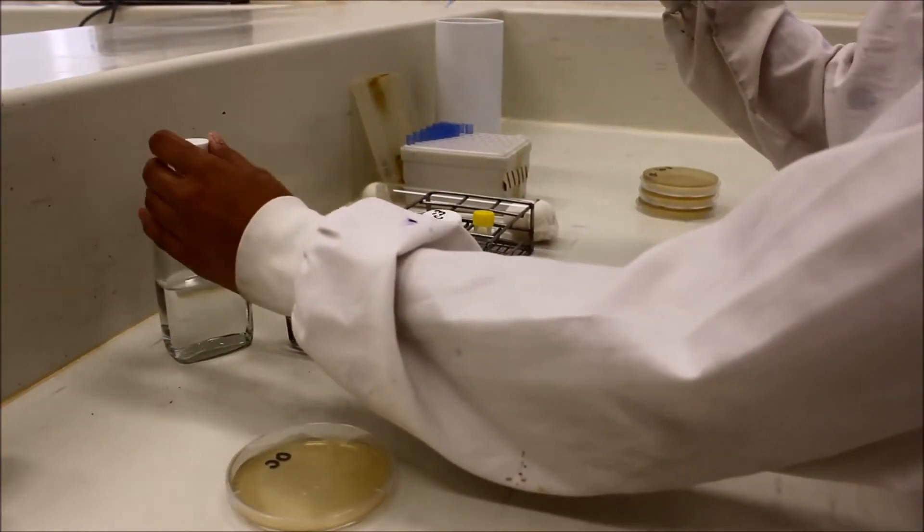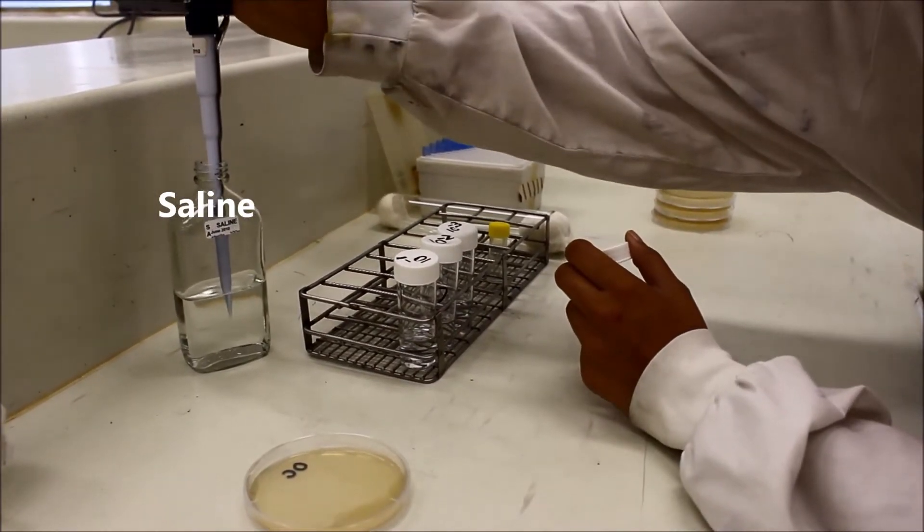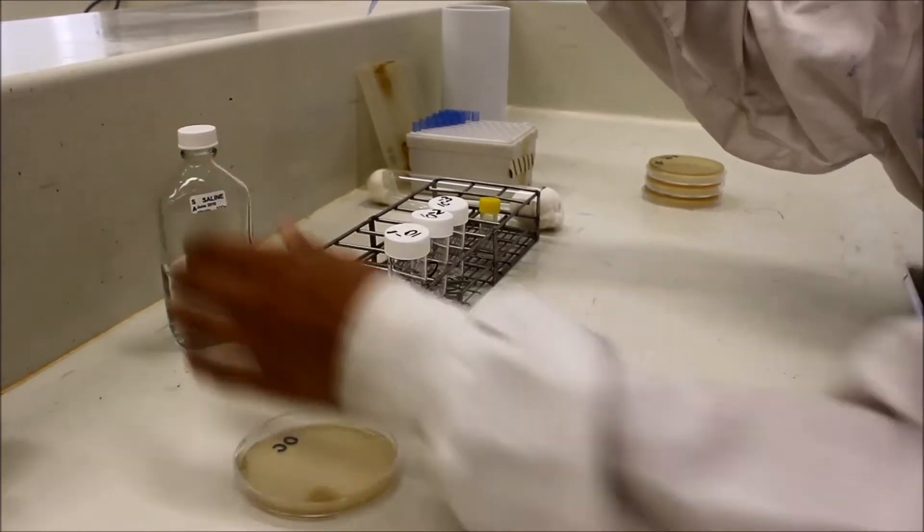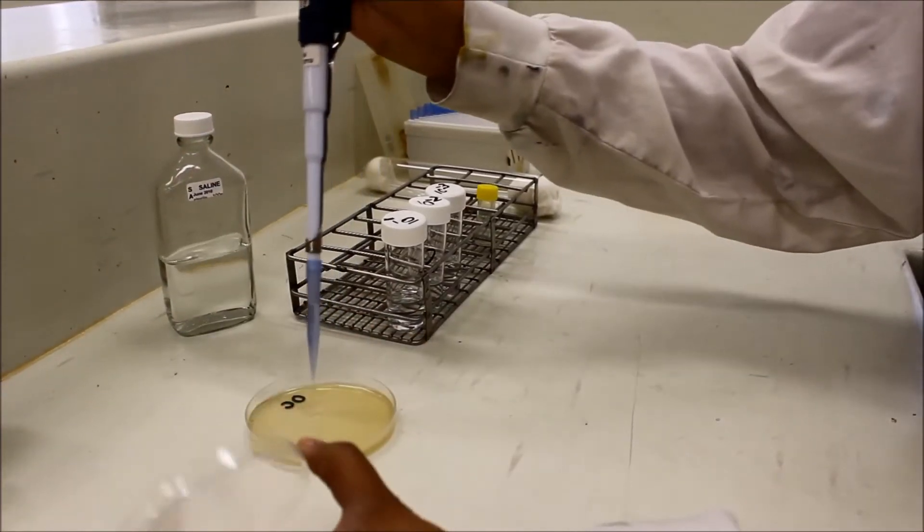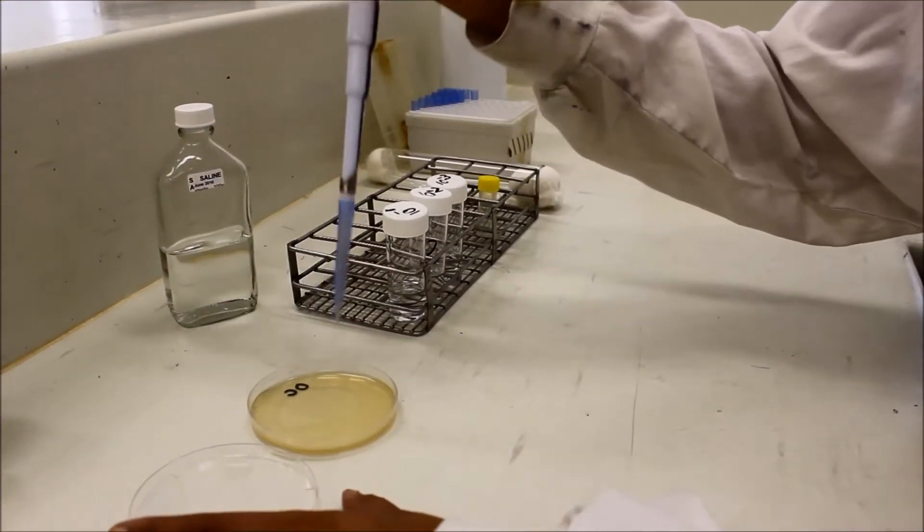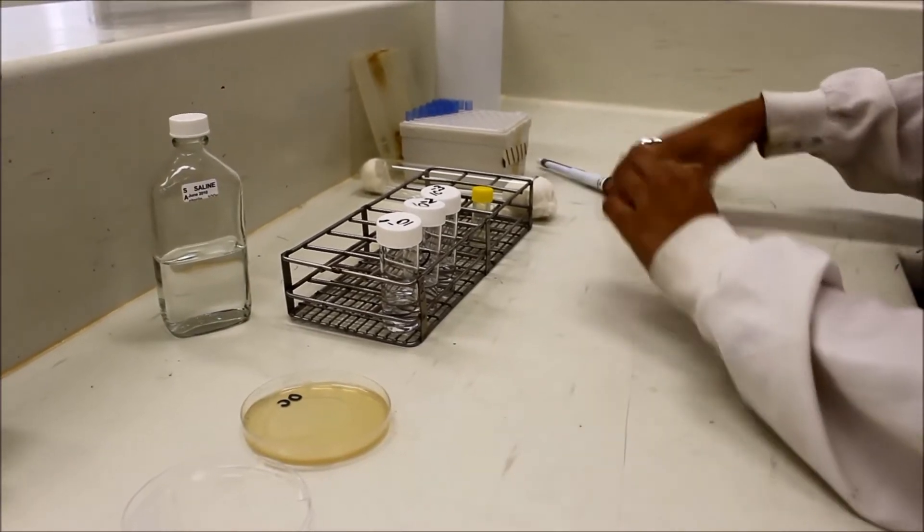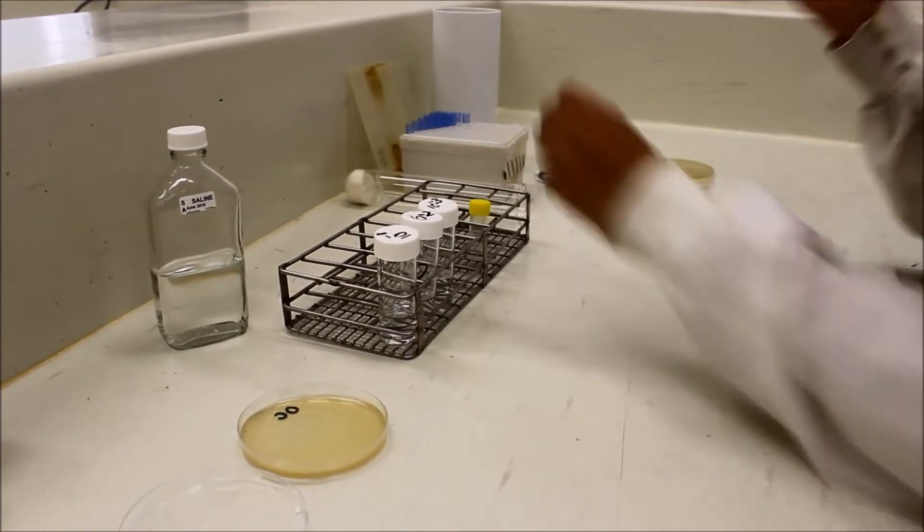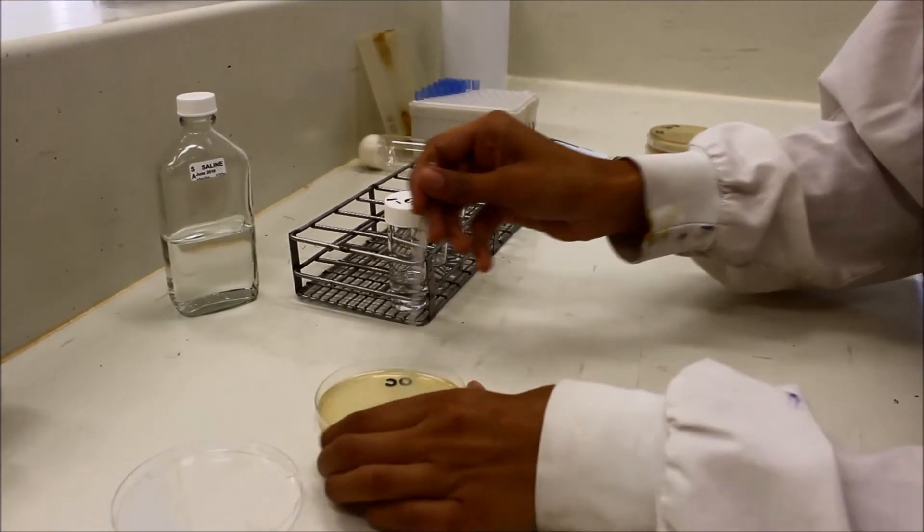Wash the surface of the zero C plate by spreading with one milliliter of saline using a glass spreader. This washing process is for calculating the number of viable cells growing on the surface.